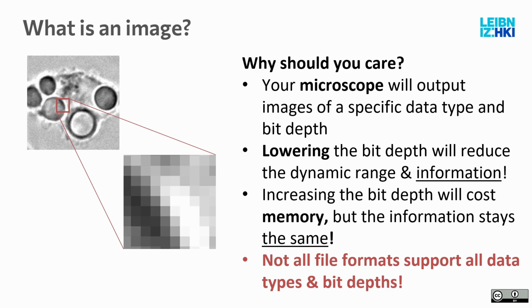So, as we talked a bit about these colors, why should I care about this abstract image and data type and everything, and splitting the bits? You see them in ImageJ and then they do something and they work somewhat, unless they don't. So why should you know about this? Because when you output things from your microscope and you go to the settings there, you can absolutely mess this up and then make the analysis completely unusable later on, or make it very, very hard.